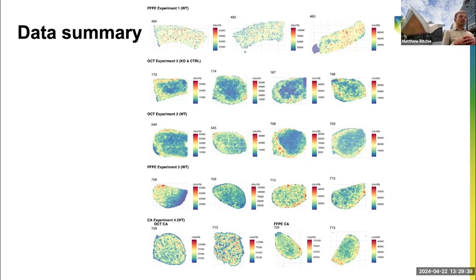So yeah, we get variation, you can see there in terms of the counts per spot, particularly the early experiments towards the top had slightly lower counts than the later ones per region. But anyway, looking at data at this level, particularly the later samples prepared with CytAssist, the biologists are like, well, I can already see that's a beautiful spleen, which is like, okay, that's great. Maybe we need to dig a bit deeper though, to actually look at which genes are expressed in some of these regions, because it does look splodgy, but again, are the splodges biologically meaningful ones?